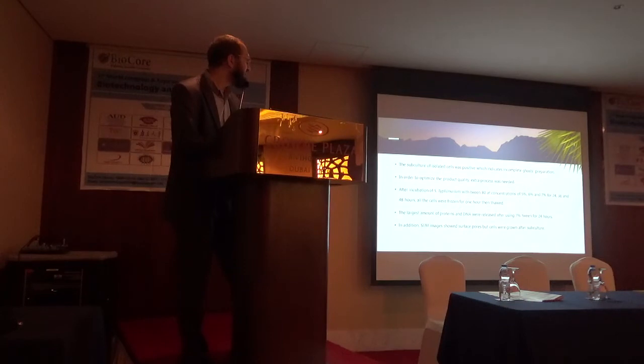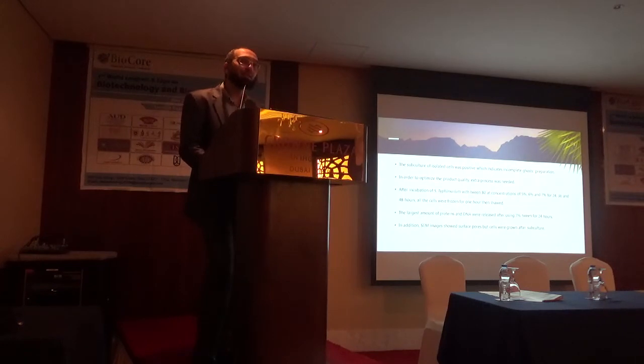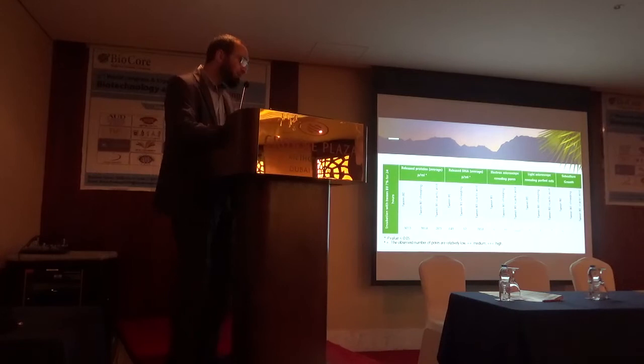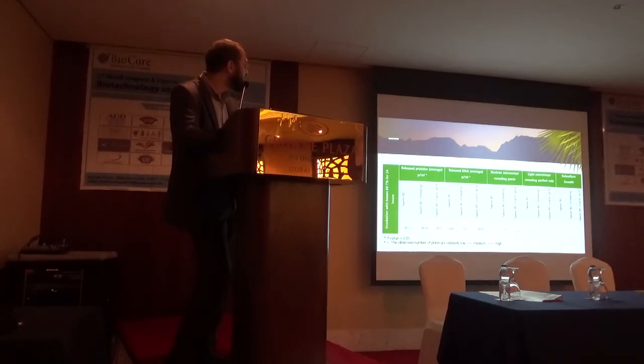The subculture of isolated cells was positive, which indicates incomplete ghost preparation. We cannot consider them complete high-quality bacterial ghosts in the presence of some live bacteria. So we have to obtain 100% killing. Using different experiments, Tween only gave us released protein of about 507.